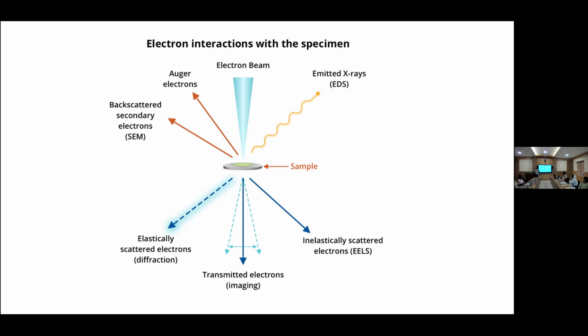And the other thing is that it is a transmission technique. So we cannot say whether other particles are on the surface or inside or on the bottom. Like in a shadow, if you place something on top, you cannot say that the particle is there on top. All those things we will discuss in the interpretation section.